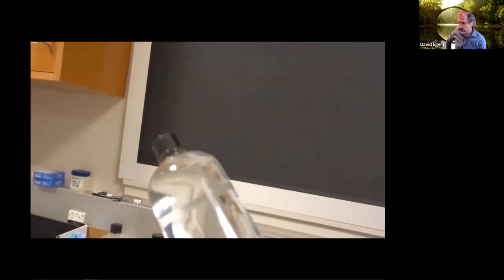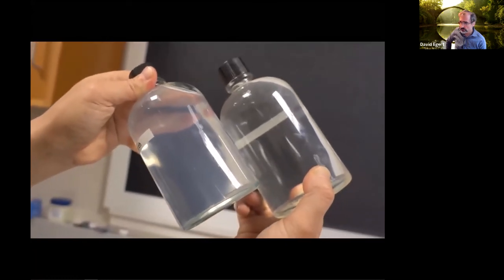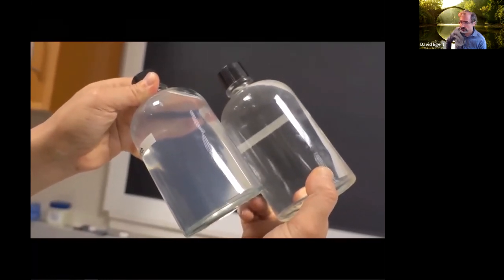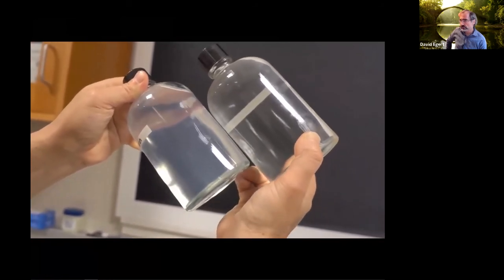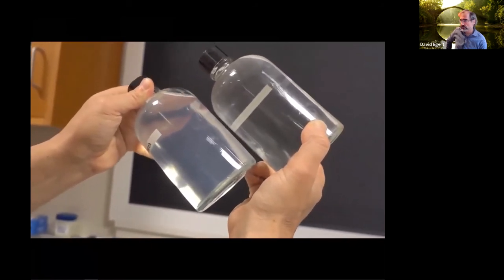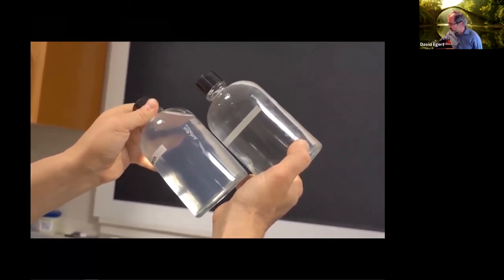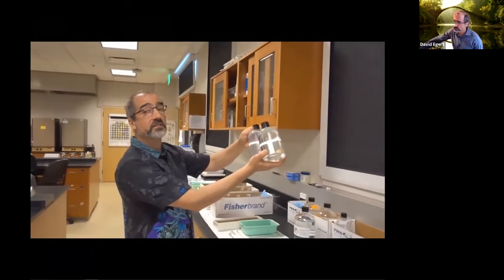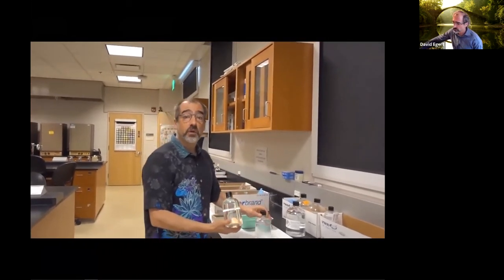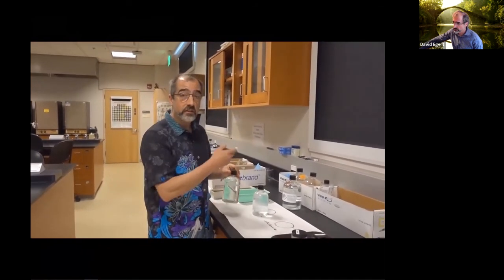Whereas when you have a starch solution, I don't know if you can notice it here, a colloid does scatter light, which basically means it's kind of cloudy or milky looking. And hopefully, this is a demonstration lab, trying to get you to have a more personal sense of, oh yeah, I see that glucose dissolves into a transparent solution, whereas the starch is dissolving as well, but it's creating a different kind of mixture, this colloid, which you can physically see as being different.